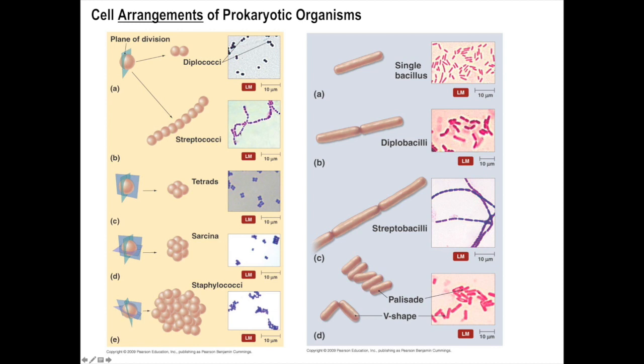So this would be streptococcus. This chain over here is formed of rods, in other words, bacilli, so that's streptobacilli. And so down here we have staphylococci, which is what staphylococcus is named for. And when you look at Staphylococcus epidermidis under your microscope, you should see something that looks like this. So staphylo is this kind of bunched grape-looking arrangement, and it is cocci because they are made of coccus. So understand that this is arrangement we're talking about when we're talking about diplo, strepto, tetrad, staphylo, and be able to look at an image and be able to say what it is. So if I were to give you an image on this and ask you what is the cell morphology and arrangement, you would say streptobacilli.